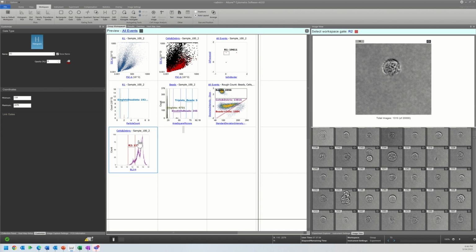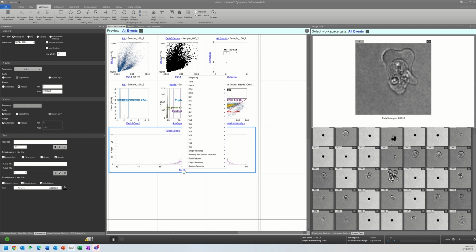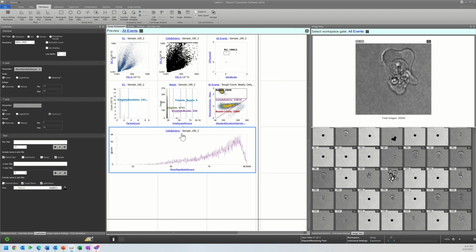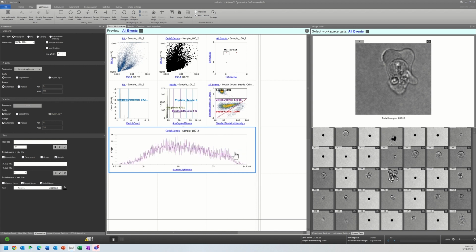So the way that I would approach this is to first clean up the sample and try to separate out the cells. And we are going to use a parameter that is also very useful for identifying interactions between events versus coincidental events. So we'll use this same parameter twice. So minor major ratio percent. And then also eccentricity percent.